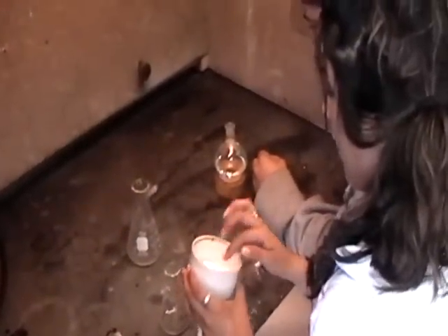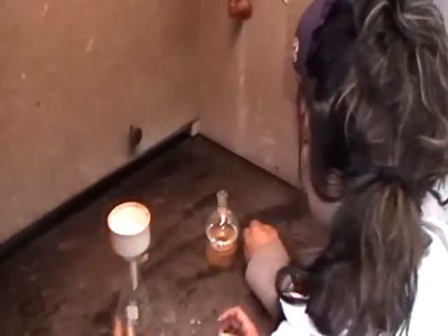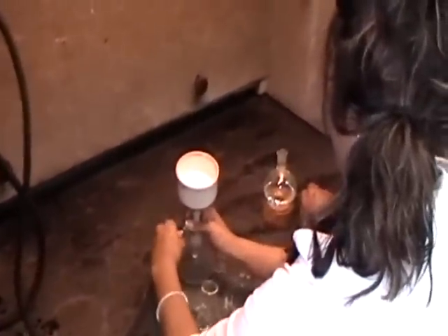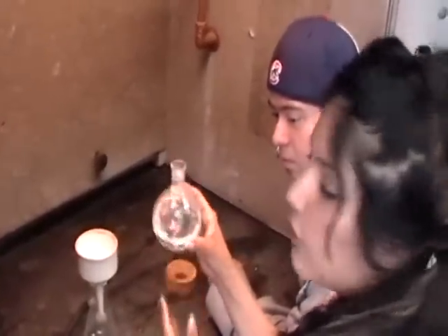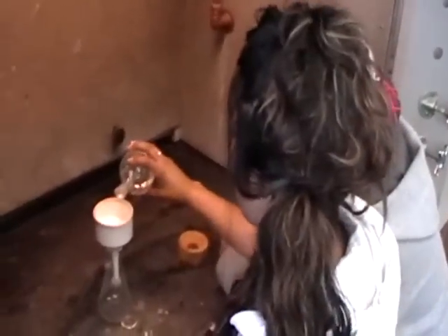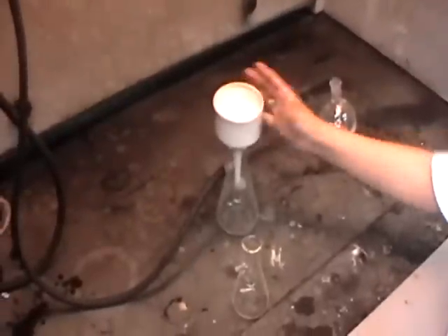The funnel paper goes on top of the filtration funnel. You can wet it a little bit to filter it. Put it in the flask and grab the water output and stick it in to the end of here. We're using water, so put whatever substance you have in, turn on the water, and it should suction it out. Then just wait.